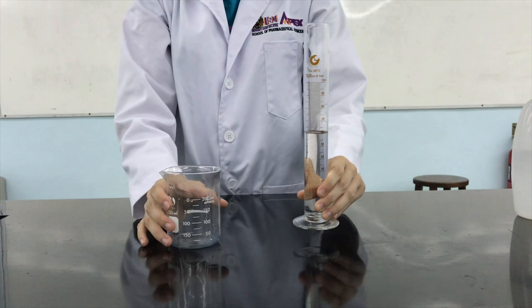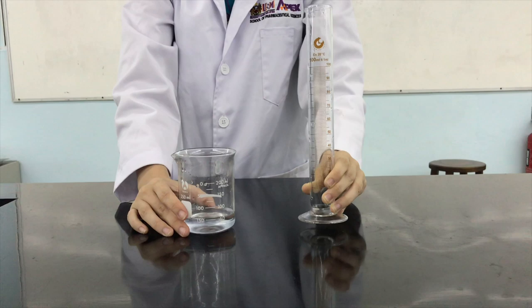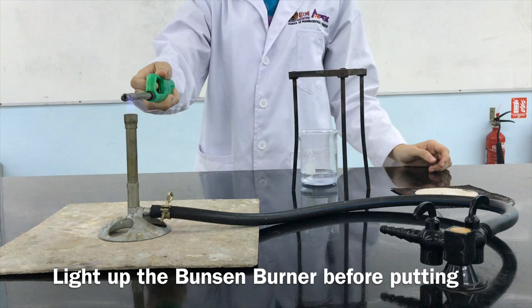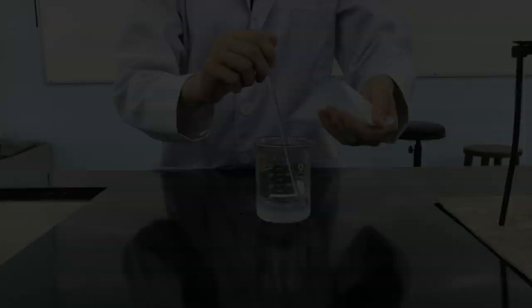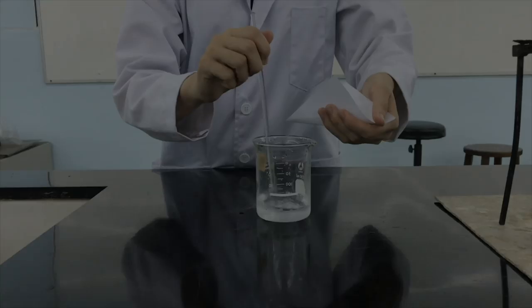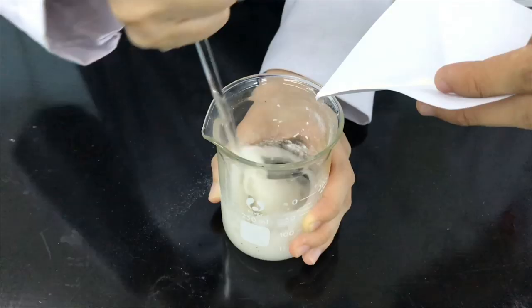Measure 60ml of distilled water and transfer into the beaker. Light up the Bunsen burner before putting the tripod stand with wire gauze. Transfer 5g of methyl cellulose into the beaker, portion by portion with continuous stirring, to ensure there is no lump formation. Stir the mixture until the gel is formed.